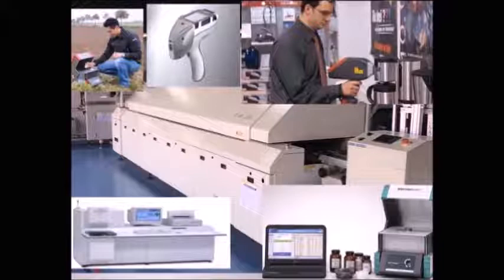There is a large number of spectroscopic techniques, for example, acoustic resonance spectroscopy, Auger electron spectroscopy, coherent anti-Stokes Raman spectroscopy, cold vapor atomic fluorescence spectroscopy, deep-level transient spectroscopy, dual polarization interferometry, electron paramagnetic resonance spectroscopy, force spectroscopy, Fourier transform spectroscopy, Fourier transform infrared spectroscopy, hadron spectroscopy. Spectroscopic instruments come in various sizes to fit their wide applications, from tiny ones to huge ones. You can imagine the Hubble telescope as a spectroscopic instrument.